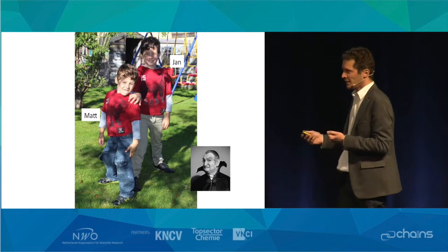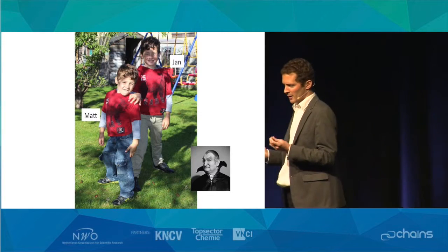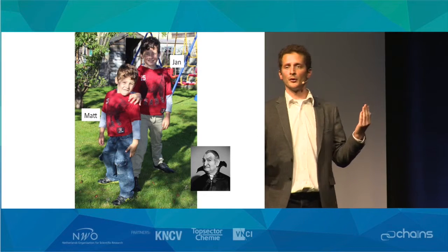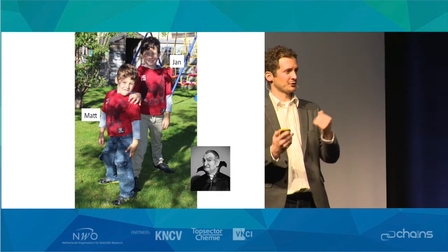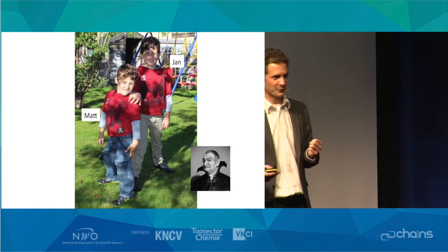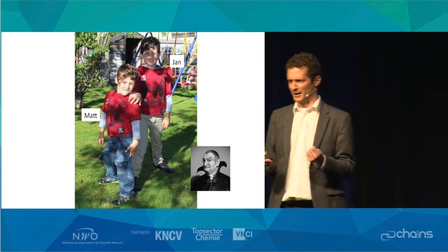So I like to illustrate the effect of direct detectors on our field with just a picture taken on a normal personal photographic camera, because the photographic camera has gone through a similar evolution as the electron detectors. And these are my 2 favorite particles. They're called Jan and Matt, and this is a rather atypical sunny day in Cambridge.